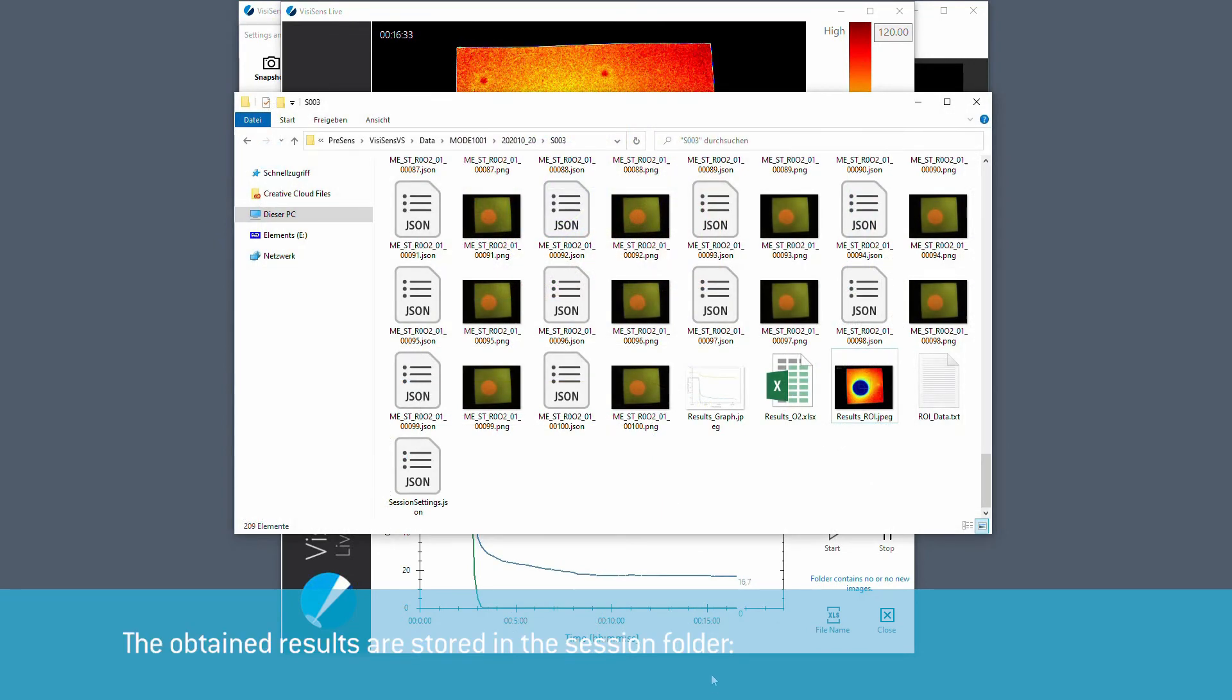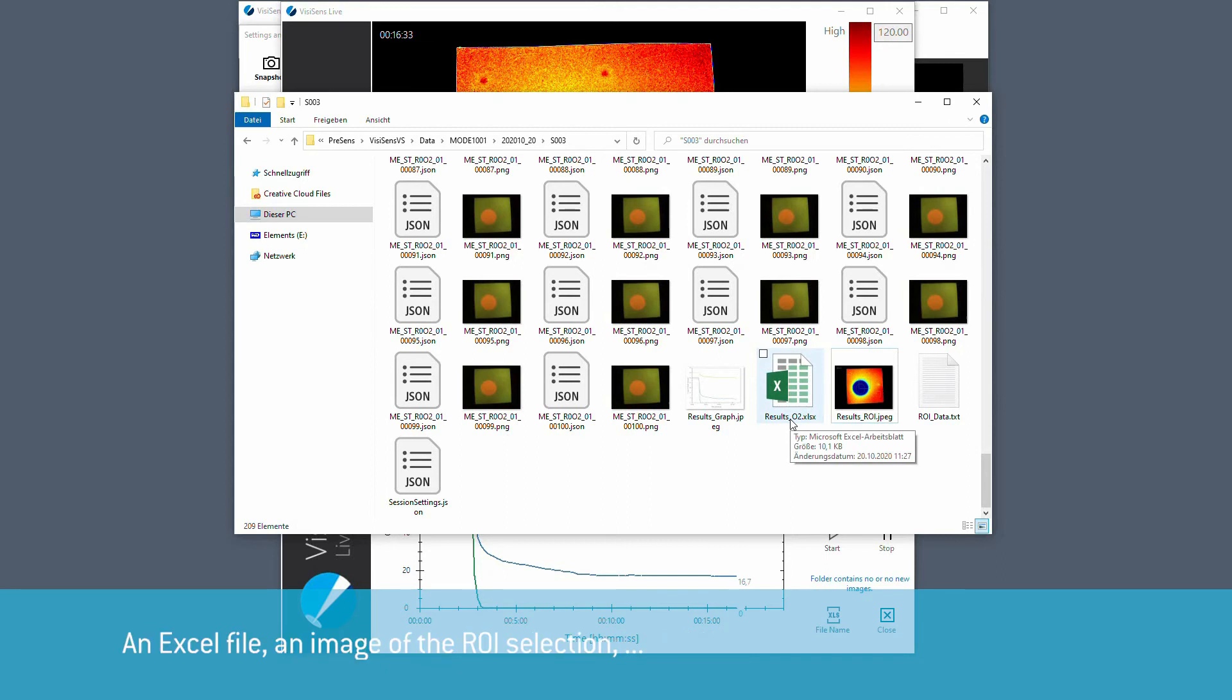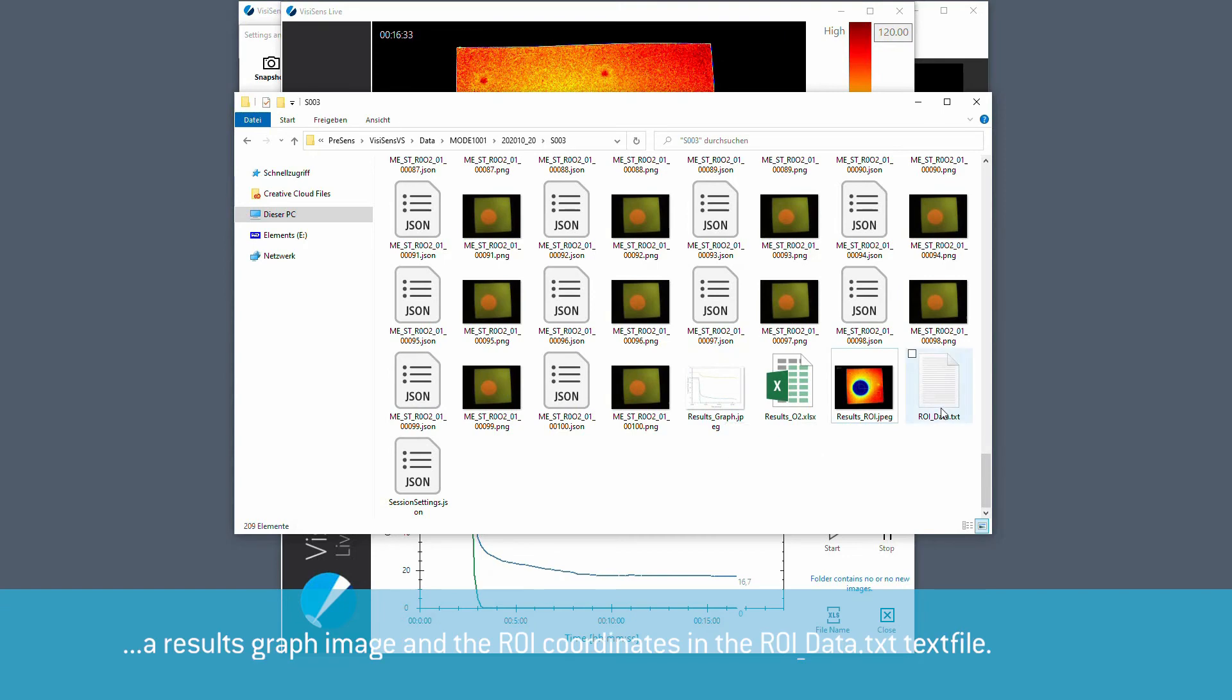The obtained results are stored in the session folder: an Excel file, an image of the ROI selection, a results graph image and the ROI coordinates in a text file.